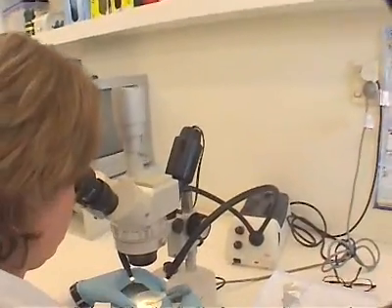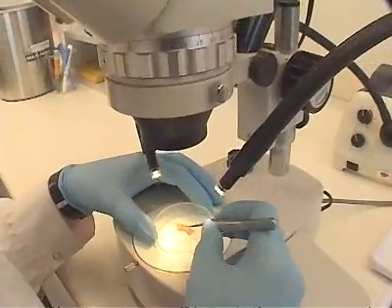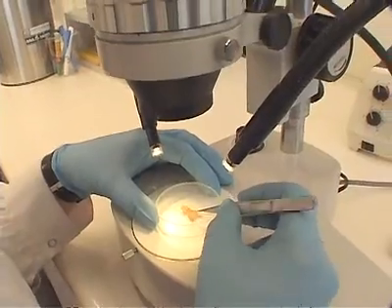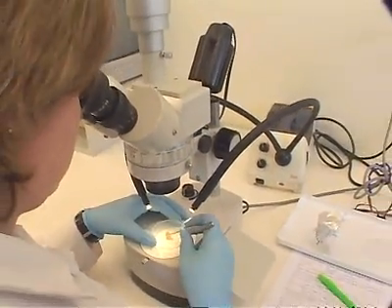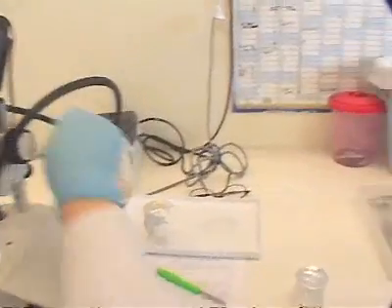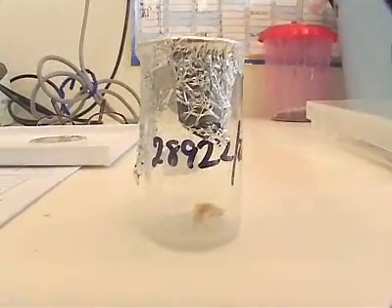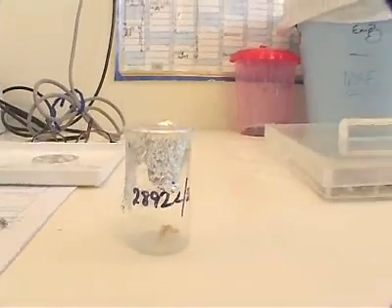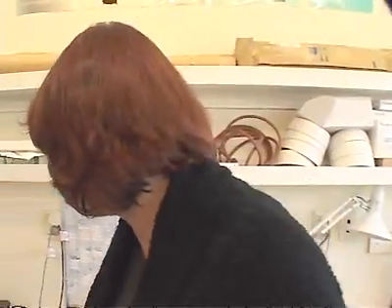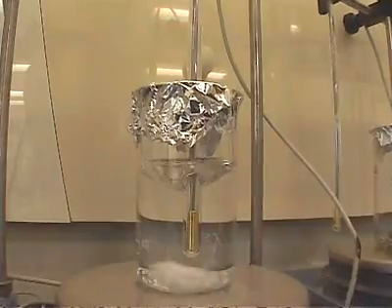The first step in radiocarbon dating is a physical pretreatment. By that, what we mean is looking at a sample to see whether or not the sample is what it's supposed to be and whether there's any contamination in it. Kelly here is looking under the microscope at a sample of wrapping from a mummy. A client wants to know how old the mummy is, and so has sent us two samples. One is wrappings from the bandages around the legs of the mummy, and the second sample is from the interior lining of the coffin.